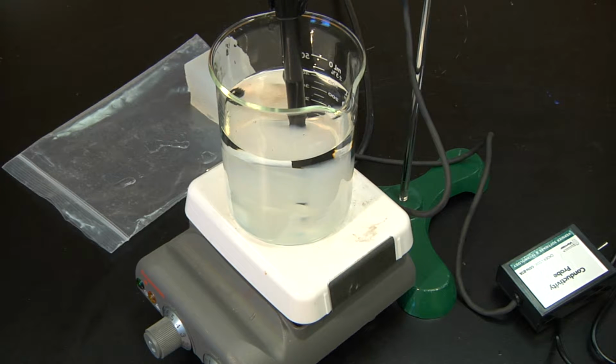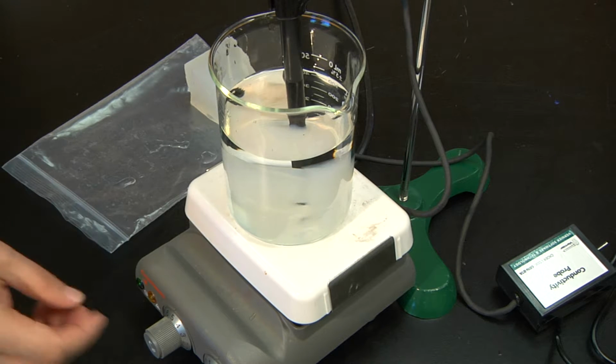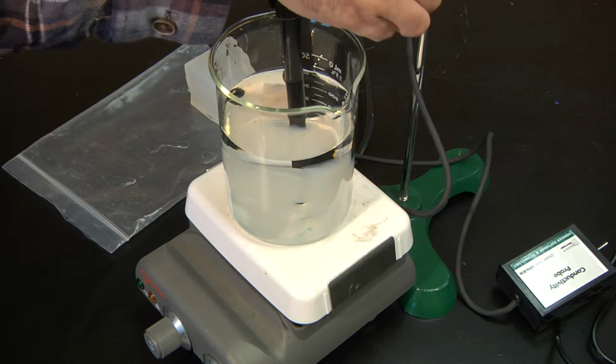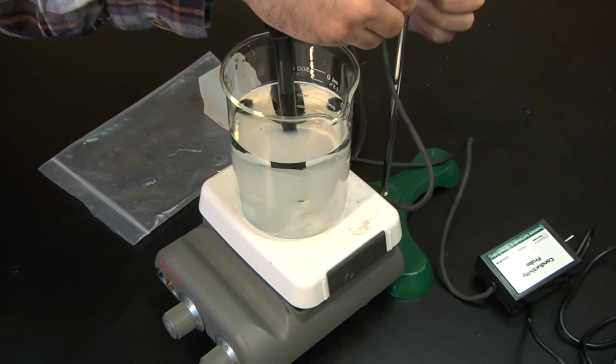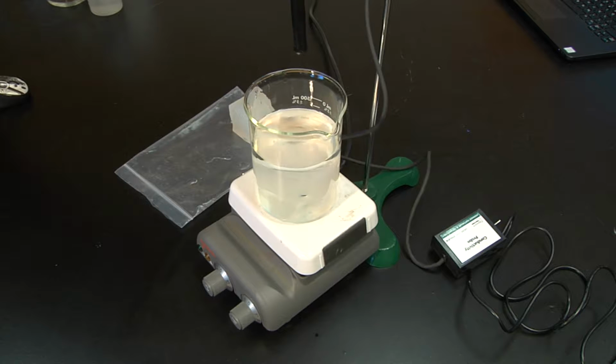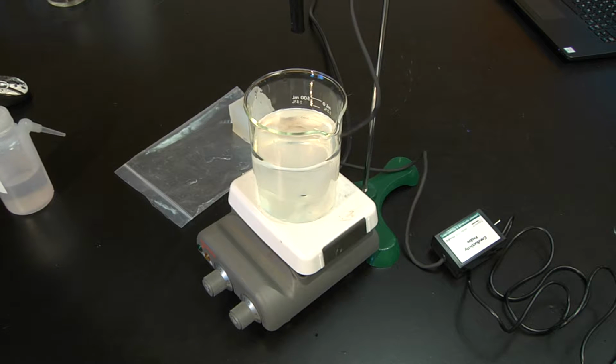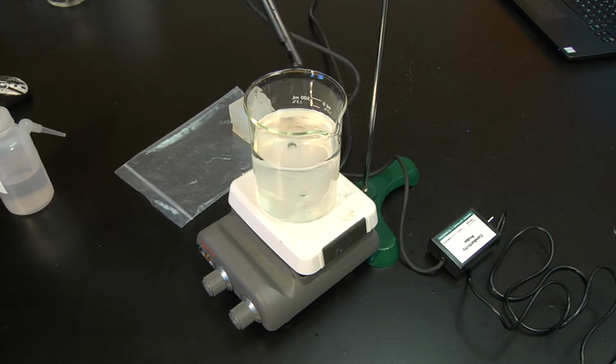Now data collection is complete. I will stop the magnetic stir. I will remove the conductivity sensor and again clean it using distilled water in order to prevent contamination between samples.